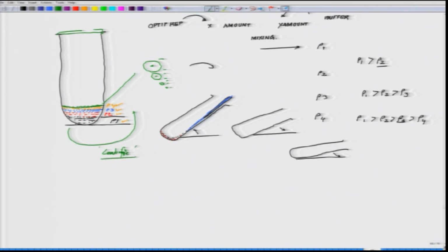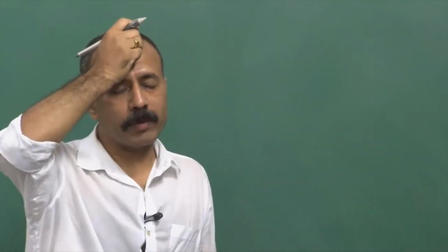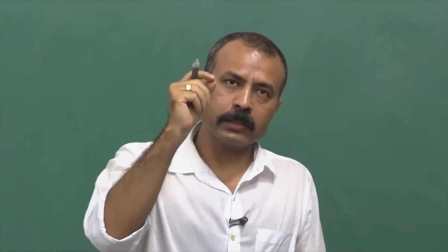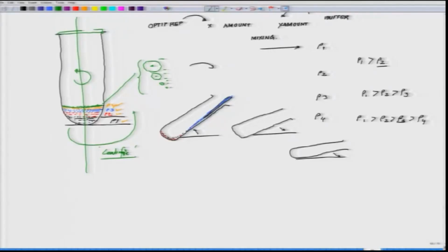While you spin it in a centrifuge, please be cautious that this topmost cellular layer has to be an exceptionally narrow band. There are people who recommend a thicker band, but over the years I have realized that really does not work, and you spin it. Once you spin it, what will happen? Depending on the density of the cell, they will settle down at different density zones.